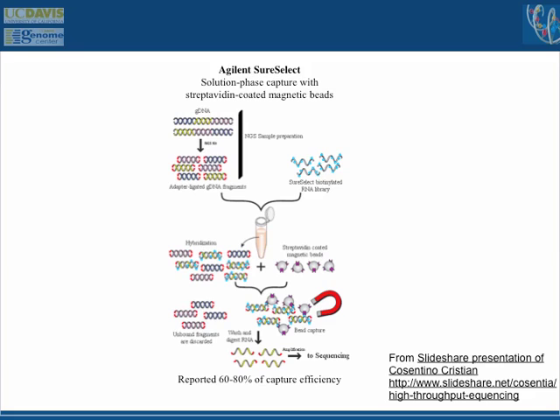Well, we're doing more like, it's not as automated or high throughput as what you're talking about, but you can purchase your own primers and make your own tags and use your own AFLPs to more inexpensively generate large samples of homologous sequences from large numbers of individuals.